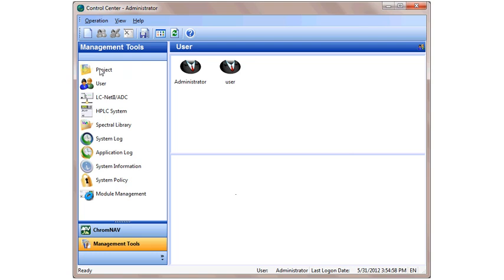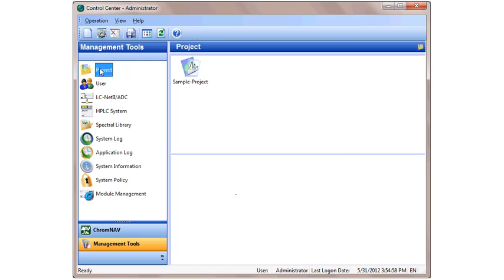The next step is to create a new project. Click Project, and you'll notice we have a sample project already created with sample data. A project is essentially a folder that keeps all of the methods, all of the data, and any analysis you do in one location.